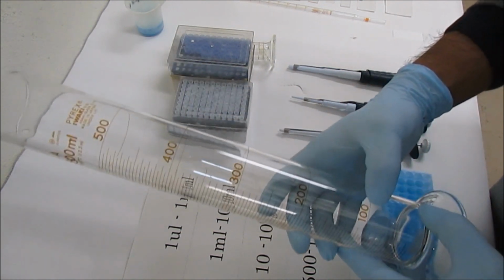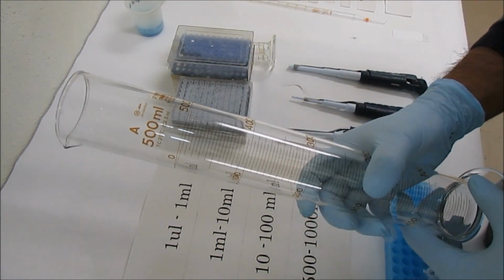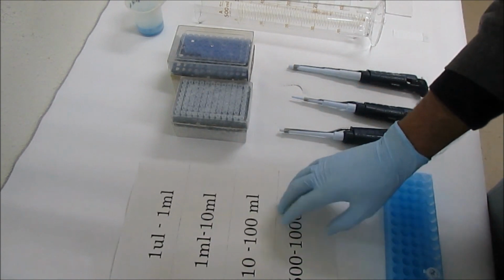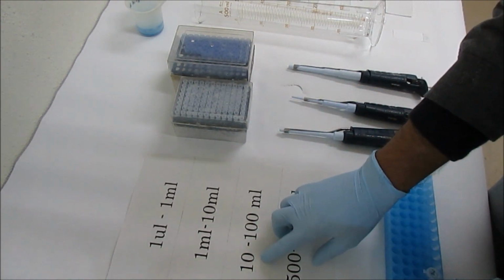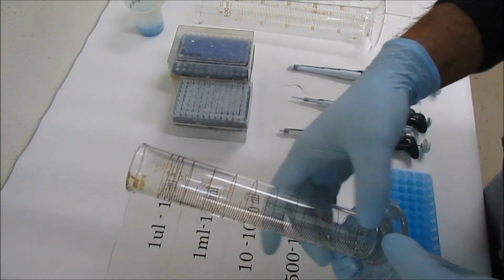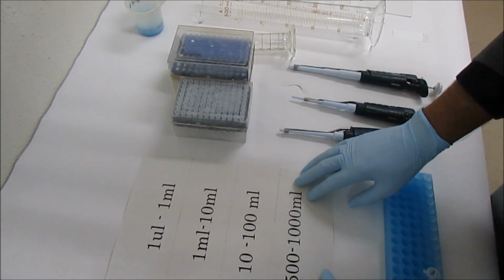Here you can see the digits: 100, 200, 300, 400, 500, right? So particularly use this measuring cylinder for measuring from 100 to 500 ml. If you want to prepare a chemical reagent in the range from 10 to 100 ml, you can use the smaller measuring cylinder. You can see the measurement from 5 to the hundreds. It's easy, and many of you are aware of the measuring cylinder.